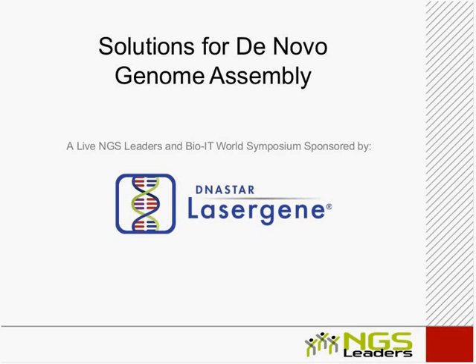I'm going to keep my introduction very short because we're going to try to keep this to about 60 minutes or as close thereto as we can. And it's important that you hear from the talent and not from me. So we're here to talk about the process and some ideas and strategies for selecting the right tools and software for de novo complex genome assembly, which is obviously a critical undertaking, particularly given the ubiquity of short-read sequence data pouring off second-generation instruments.